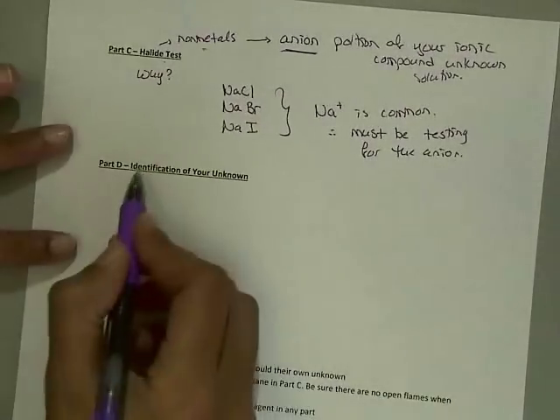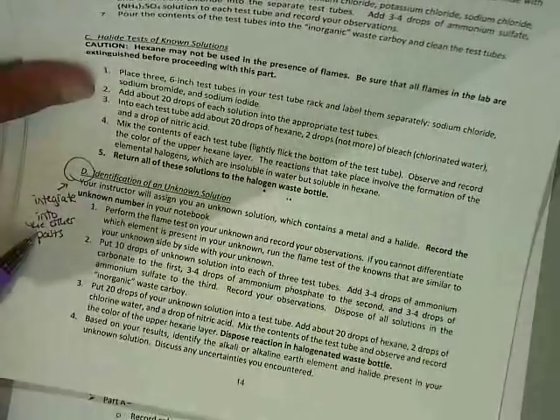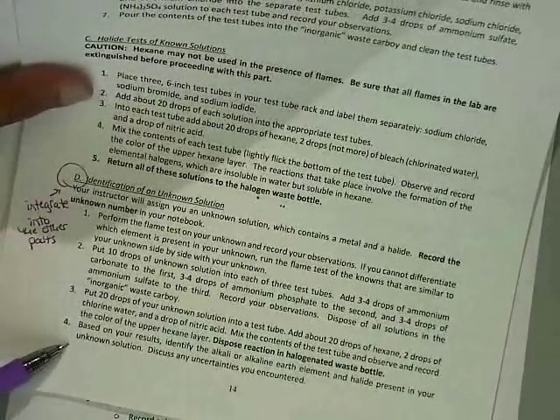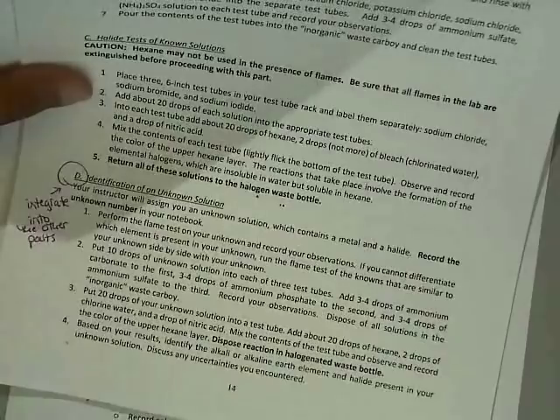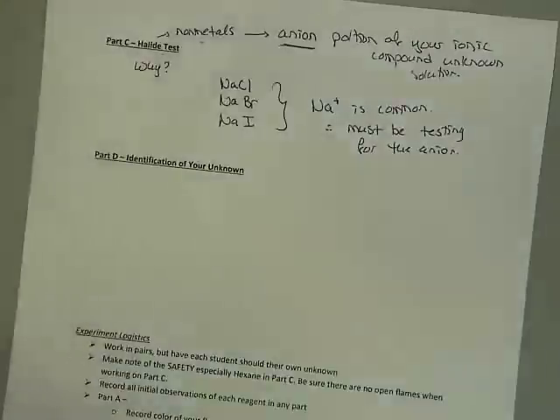Now lastly, part D of your lab experiment, I strongly advise you to integrate part D with the other parts. This is going to save you a lot of time in terms of setup. So this is basically repeating parts A, B, and C for your unknown. So might as well tack on another test tube and perform part D along with parts A through C, because part D is basically the identification of your unknown.